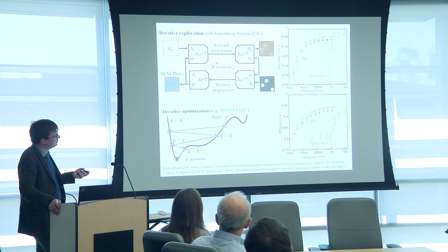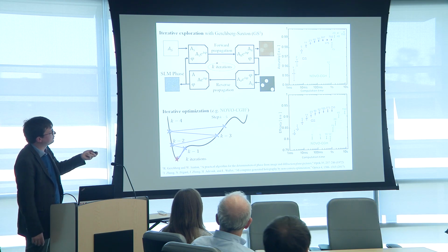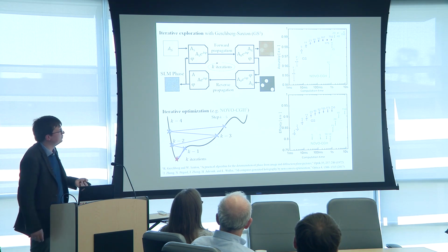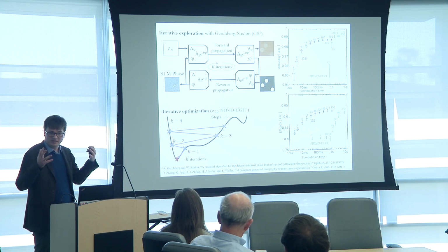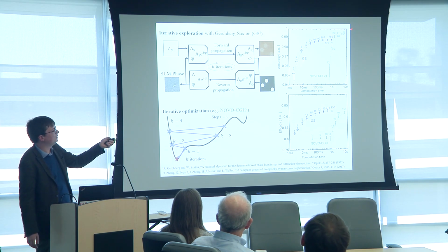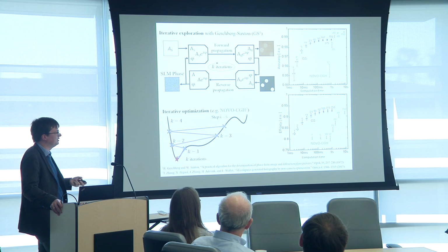This was the second technique that we've been working on. Basically, upgrading from the historical and most popular way to make holograms, this technique gives you extra quality, but at the expense of time. So if you want to make holograms that are very photon efficient, or that best render a very precise scene, if you really want to make best use of your laser light, you may be interested in those techniques and compute holograms that give you the maximal photon efficiency possible, knowing that you're going to be wasting a lot of those photons in the brain as heat.